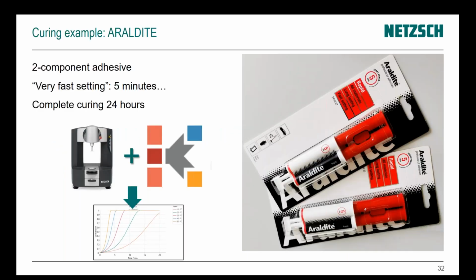So in this part, what we're doing, relatively simple epoxy resin, 2-part. As a rheologist, because we can look at these curing profiles, always find the explanation, the very fast setting, in this case 5 minutes. Well, we'll see what happens in 5 minutes later on. But what we'll see is, although it's fast, really the curing does take a little bit of time. But what we'll do is we'll look at some conditions to say, let's get this rheology data, let's put it into Kinetics Neo, let's model it, let's fit it, and let's see what we can get.